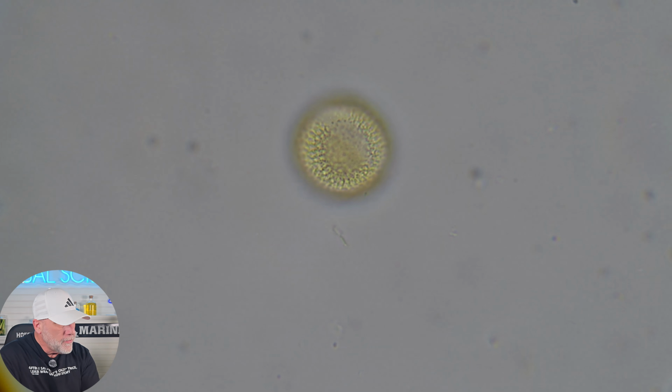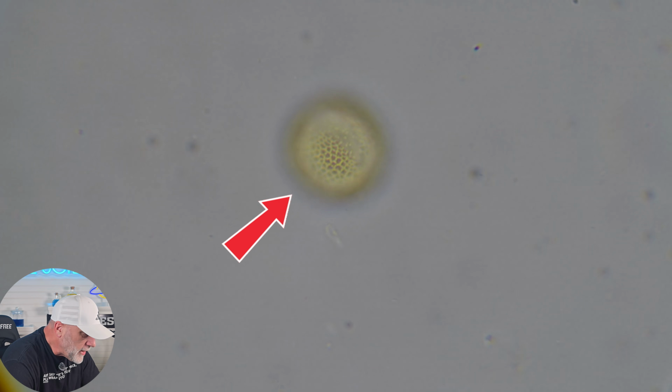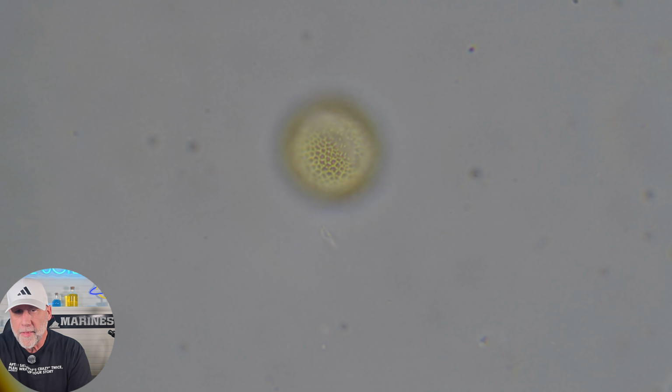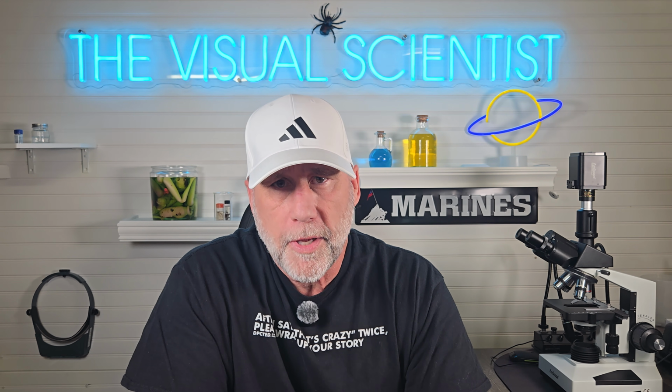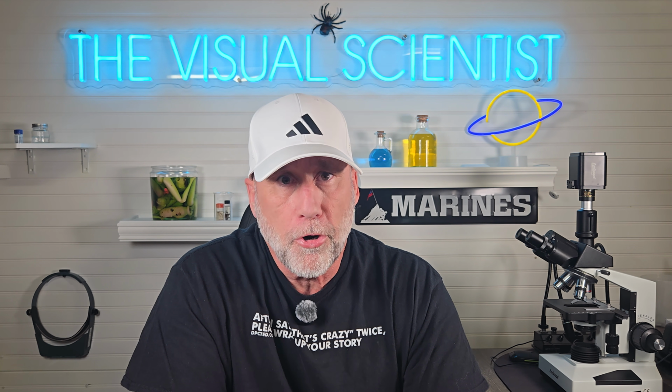Okay, stop. You see those moving particles right there? Do not change the channel. I'm not explaining that right now. I'm explaining that at the whiteboard, but I want you to see it. I want that image in your head. Burn it in your head. Don't forget it, okay? Evidence B is filed.